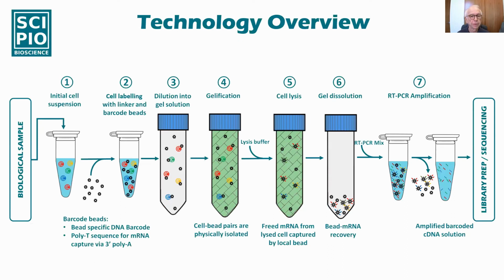And to summarize the entire process, we made it lined up here. It's basically a day's work with 4 or 5 hours of hands-on time. We can apply this method to thousands of cells at a time, and all the operations only require standard laboratory equipment and no instrument.